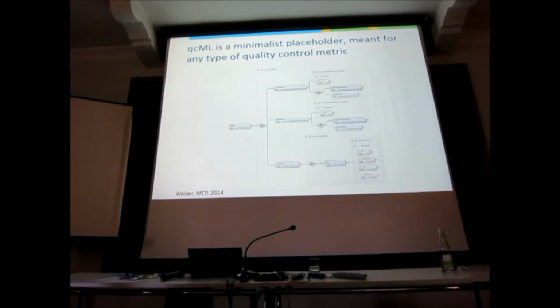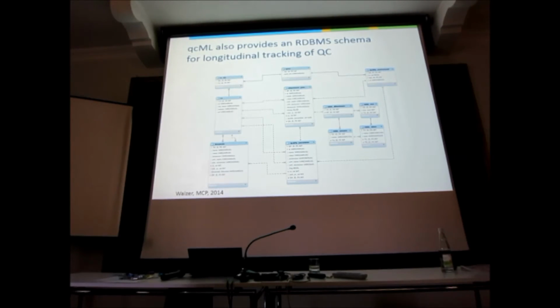Now, what is interesting about QCML is that it's an XML format, but you really don't care about that. You won't even notice it. The thing just spits it out, and you can make beautiful reports in PDF and things automatically from that, so who cares what it looks like on the inside. But what is really important, and this is something I really pressed when we were building this, is that it had to have a database equivalent. This is a database schema.